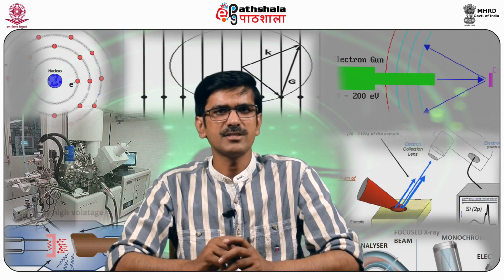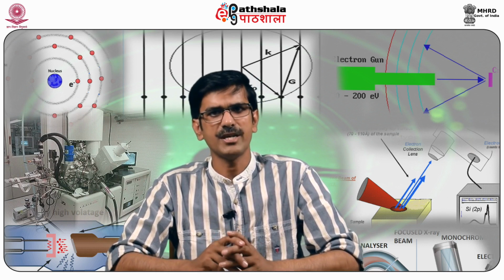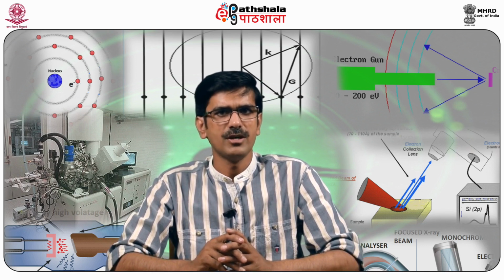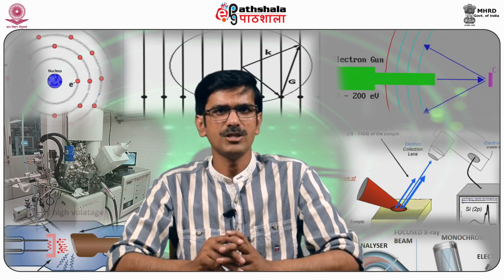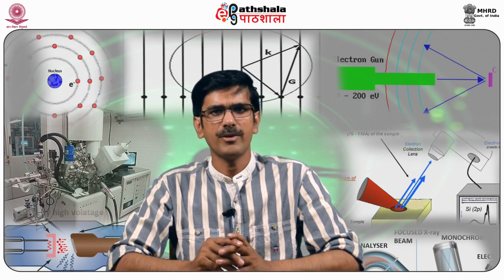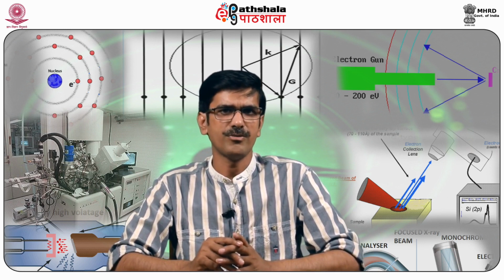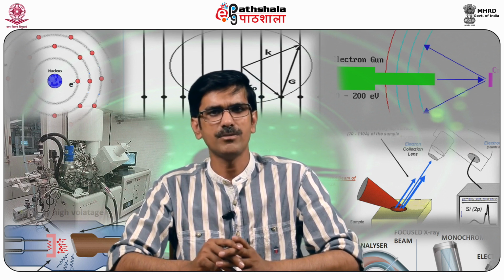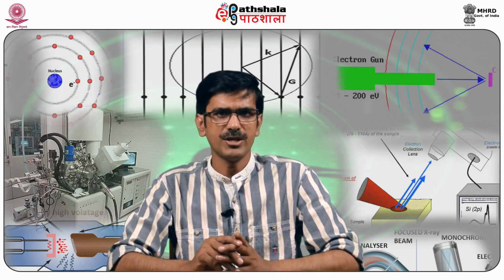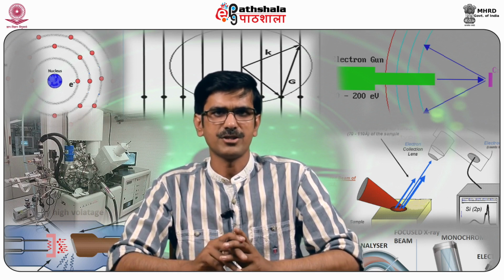In quantitative analysis, from the name, we can guess what we are going to deal with. Quantitative means we are talking about the quantity of the material or the sample. It can be obtained from X-ray counts at different energy levels. On the basis of analysis parameters and the sample composition, semi-quantitative results are easily available without standards with the help of mathematical corrections.